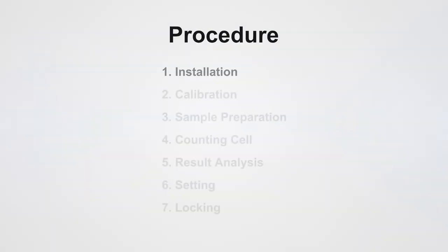The procedures are installation, calibration, sample preparation, cell counting, result analysis, setting, and locking.